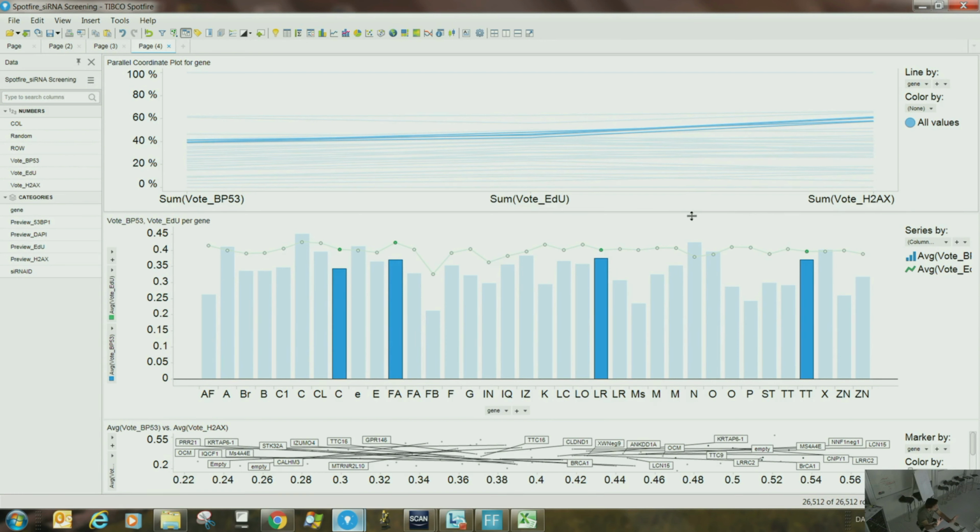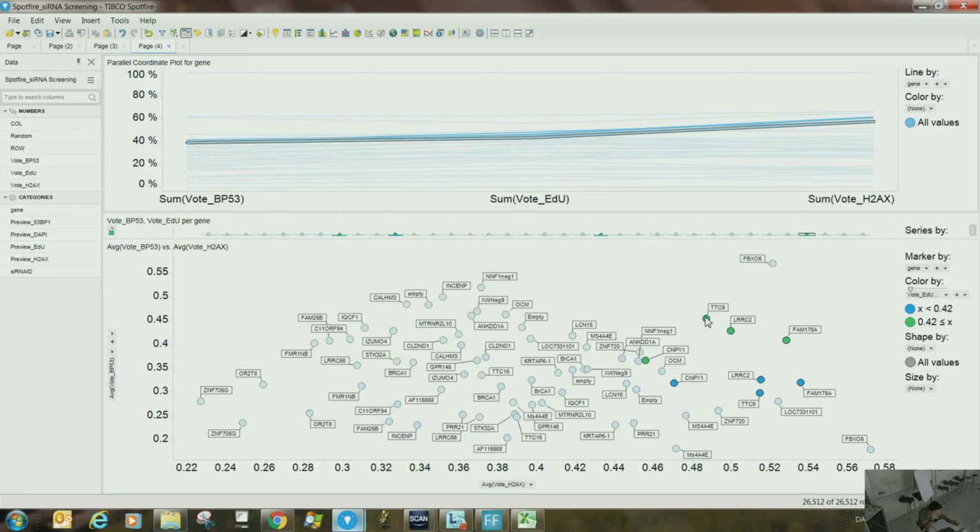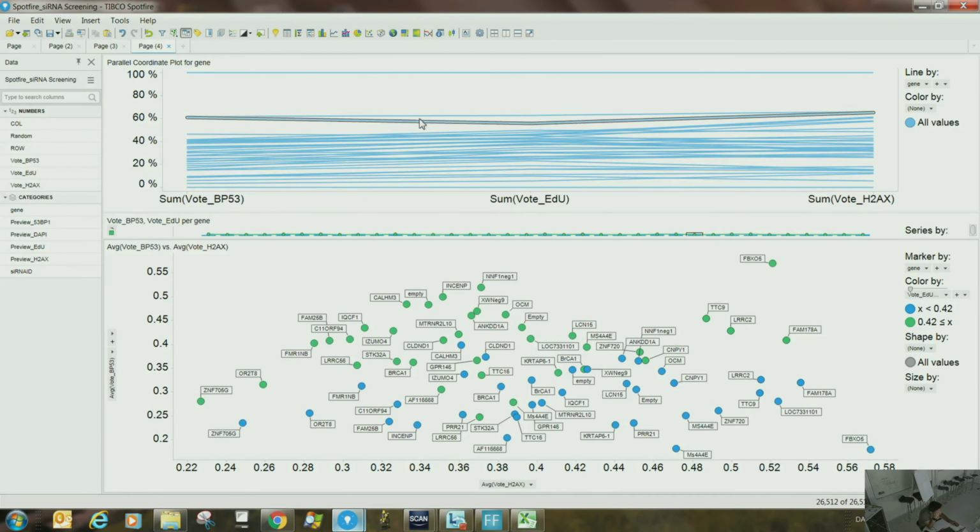By the way, nobody has used it so far, but there is a possibility of using it without doing some fancy machine learning stuff. And then you see what kind of, these are the guys actually. They are kind of similar. Not on these 2 criteria, because right now we are only looking at 2 criteria. But right now we are looking at 3 criteria now. And we can have as many criteria as we want in this case. So I think there is something similar with this particular family of genes. So let's go and investigate. You understand this part?